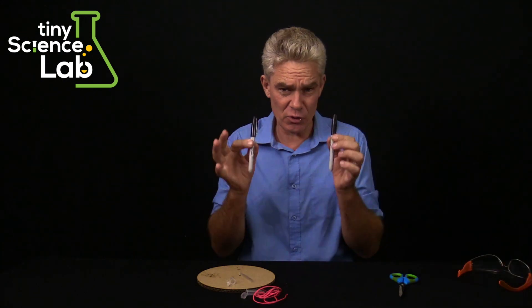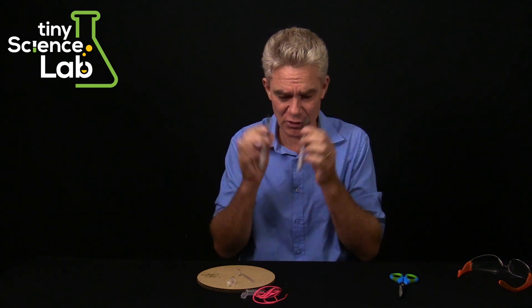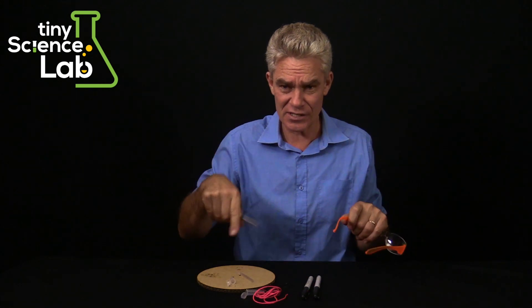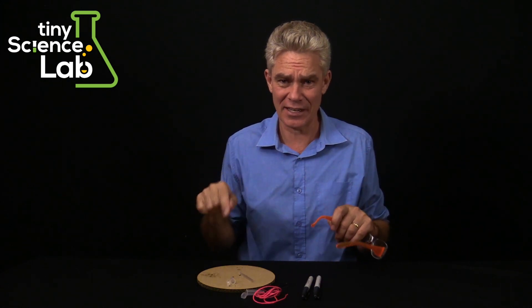What you'll need to supply is two pens — they don't need to be sharpies, they can be ballpoint pens or pencils. The only tool you're going to need is a pair of scissors. I do recommend that you have safety glasses on when you use this thing, and maybe do it where there aren't people around, because this thing goes fast.